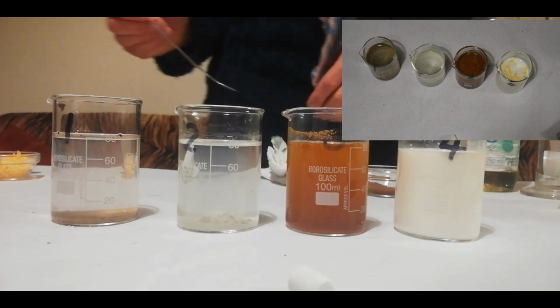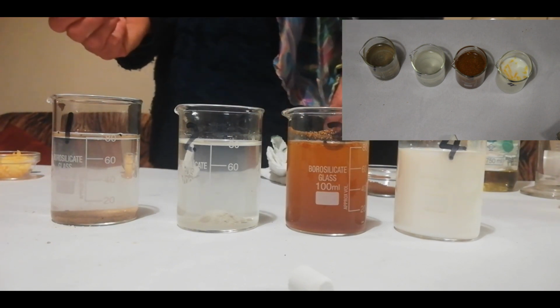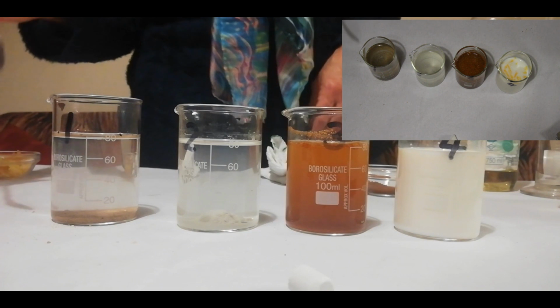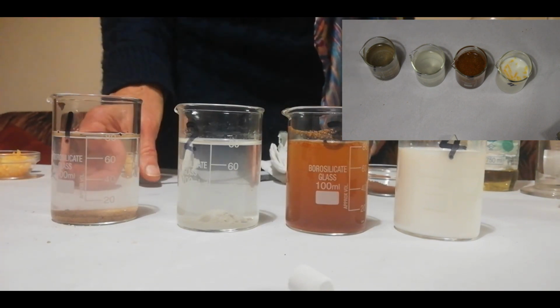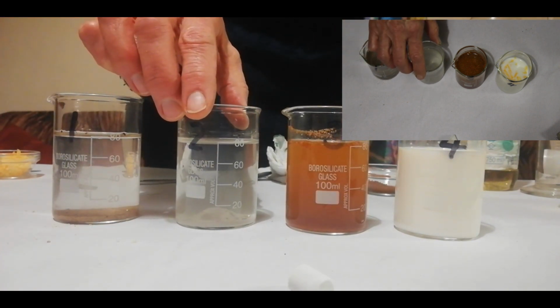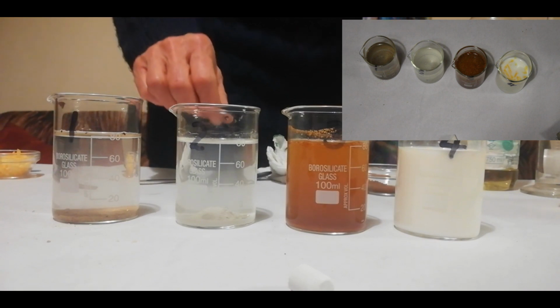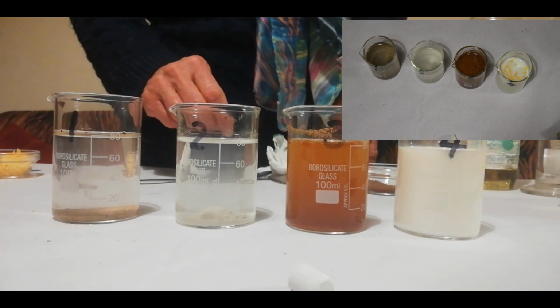Right, your textbook says we must leave them for 2 minutes. I think we have left the sand for 2 minutes. We can have a look now what has happened here at number 1. Can you see the water is beautifully clear above the sand? This one, the one with the chalk, the water is a tiny bit cloudy, but there's a nice big thick precipitate that's formed on the bottom.